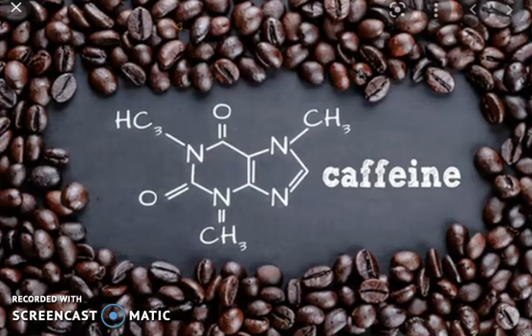So, my friend, caffeine is a base which can react with an acid to form a salt. A well-characterized salt of caffeine is caffeine salicylate, formed using salicylic acid, and this derivative of caffeine has an accurate melting point. Now I will show you the preparation of the derivative. If you want to make the derivative, caffeine salicylate, use an analytical balance; there are several top loader balances in the lab. Weigh 50 milligram of caffeine and 37 milligram of salicylic acid.